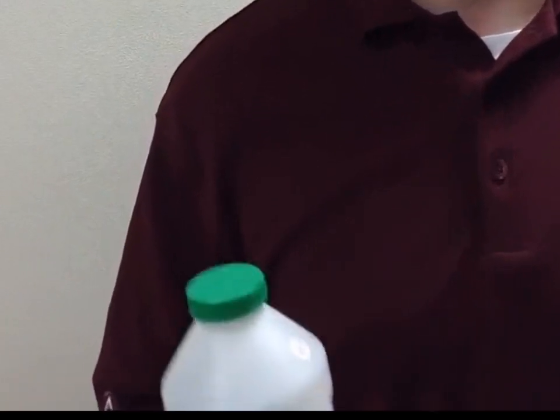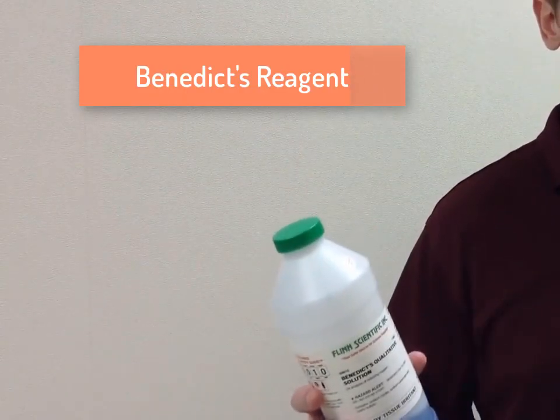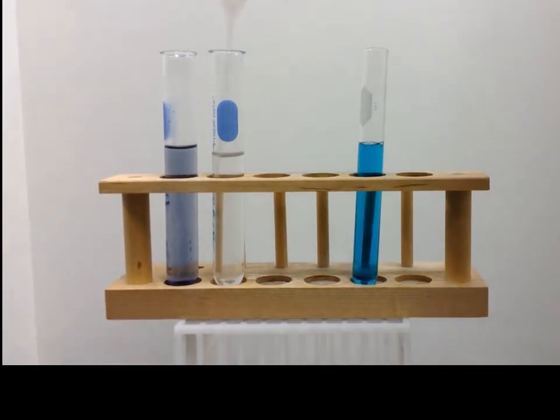Now that the enzyme has digested our starch, we'll test to see if it was broken apart into simple sugars. To do that, we'll use Benedict's solution. Benedict's solution tests for simple sugars. We'll take some of our digested starch and place this into our Benedict solution. This will allow us to test for the presence of sugars.